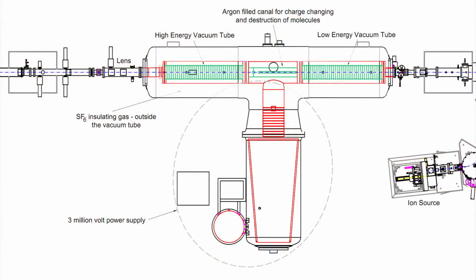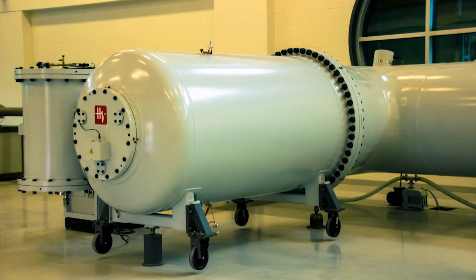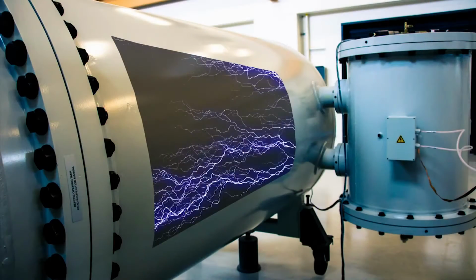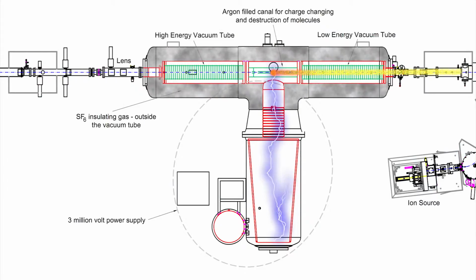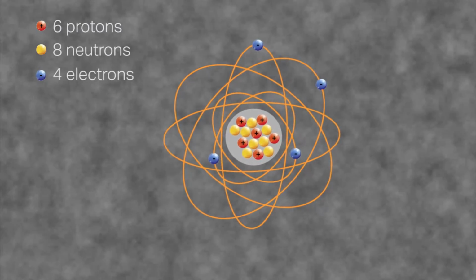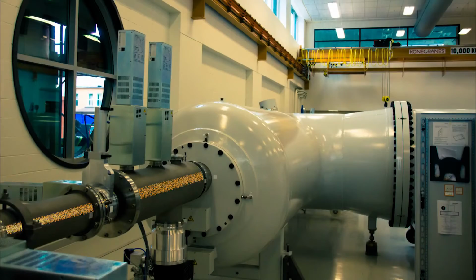So we're looking at a tank right here. It's a T-shaped tank filled with an insulant, sulfur hexafluoride, because we're going to create a huge voltage in that tank. It's like a big transformer that you see in hydro systems, except ours is 3 million volts. So we're going to race those ions towards that positive pole, and then we're going to switch them. We're going to strip those electrons off carbon and turn it into a positive ion just as it hits that positive pole, and it's going to shoot them out the other end.